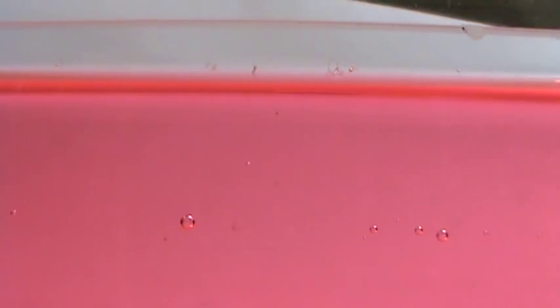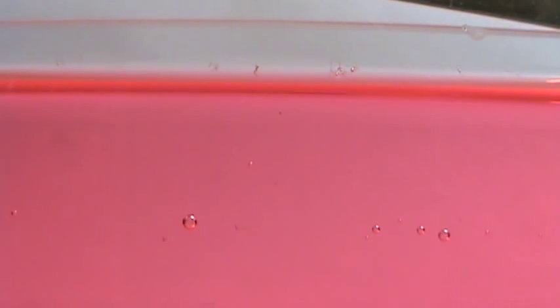And remember, that's going through 15 centimeters of liquid. If I come around, and again, I've got my paper back there, and look at the same solution from this direction, well, it's still red, certainly, but it's much less intensely red than it was in the other direction because the path length is shorter. So path length affects how much light is absorbed or how intense the color of something is.